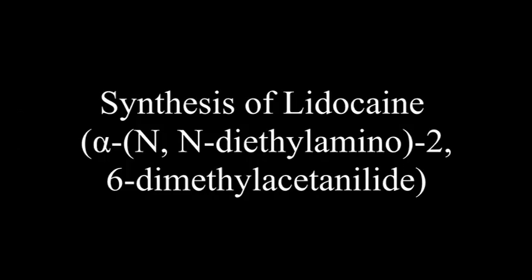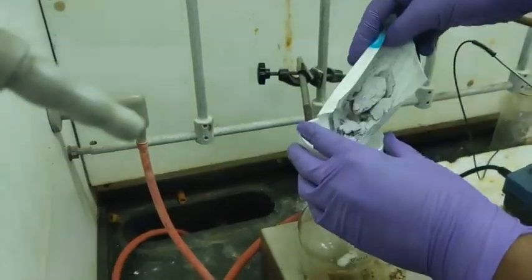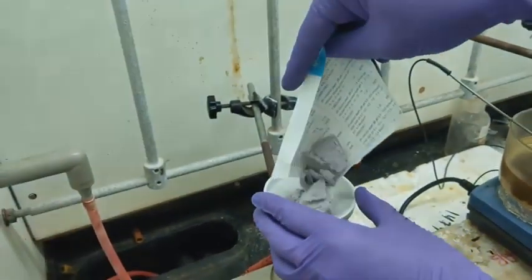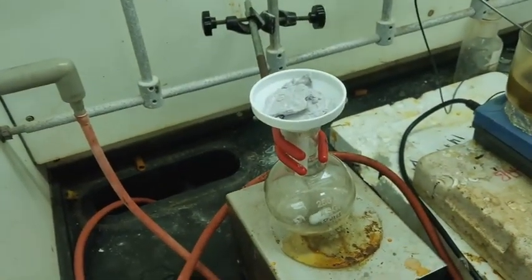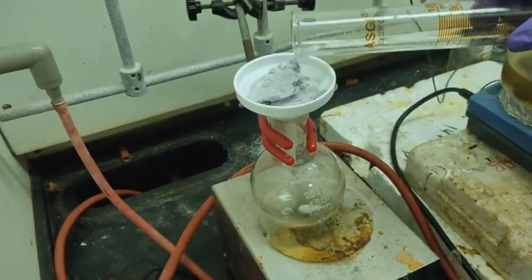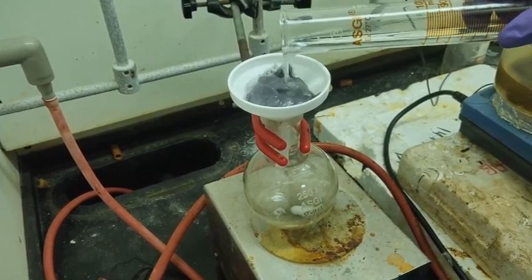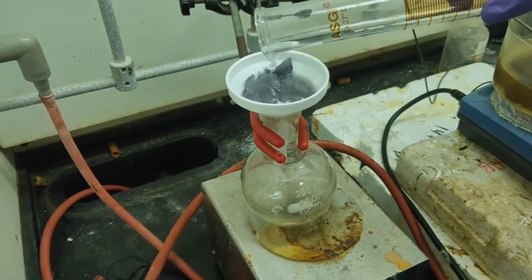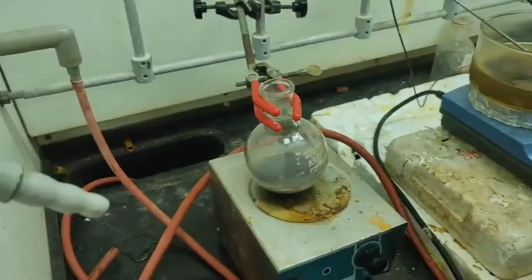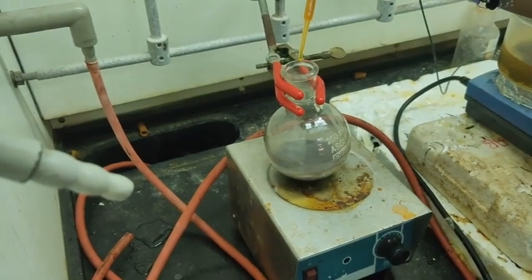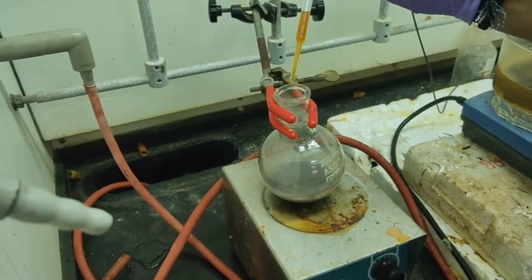Part two: synthesis of lignocaine. The product from the previous step was transferred to a round-bottom flask by dissolving it in 25 mL of toluene. Under stirring conditions, add three equivalents of diethylamine into the solution in a dropwise manner.